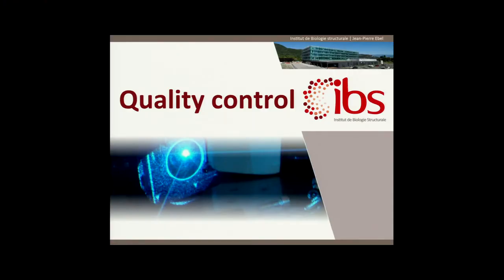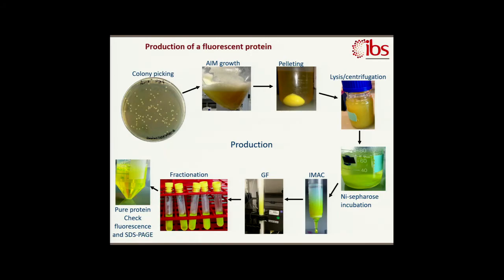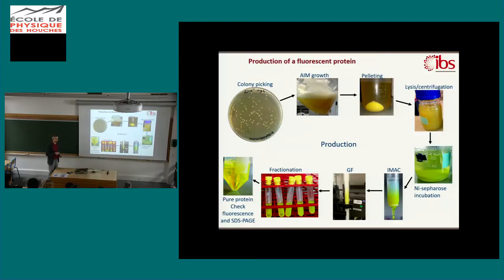And about quality control, let's say that you want to produce a fluorescent protein, and you want to check if it's a good protein and check all its possible characteristics. You want to characterize it totally. I guess that you're pretty used to that. If not, please ask me questions. That's everything that is very common for all proteins, except that you have the advantage that you can see the protein all along the process. That's very convenient. You never have to take measurements or gels or whatever to know if your protein is in your fraction, because you see it directly.